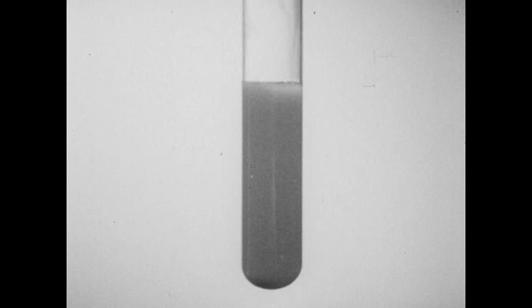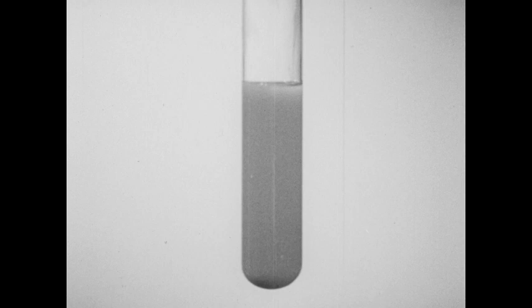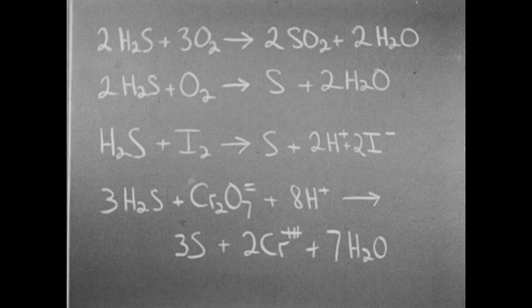You should notice that the orange color of the potassium dichromate solution has changed to green. This greenish color is characteristic of the chromium three-plus ion. You should also notice that the solution has become milky. This milky appearance is due to the presence of millions of tiny particles of elementary sulfur, which have been formed as the hydrogen sulfide was oxidized by the dichromate.